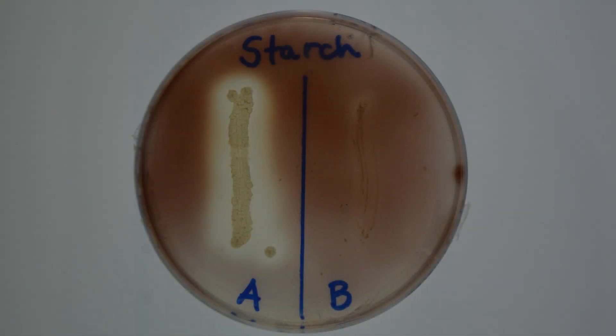Now, let's check our plate to see what we have. Notice, the color developed very quickly, and there is a clear zone surrounding one of the bacterial colonies. Starch was hydrolyzed. This indicates the production of alpha amylase by this particular bacterium. This clear area is a positive result. Now, look at this other bacterium — it has color surrounding the colony. This indicates a negative result.